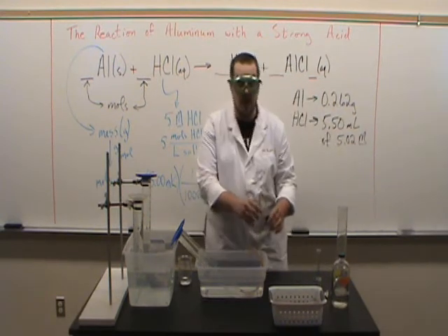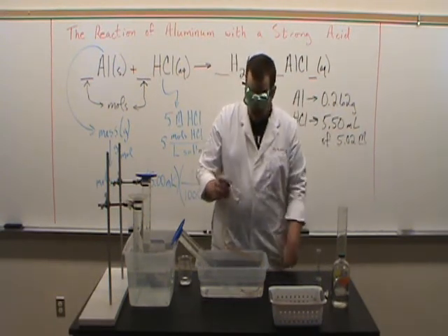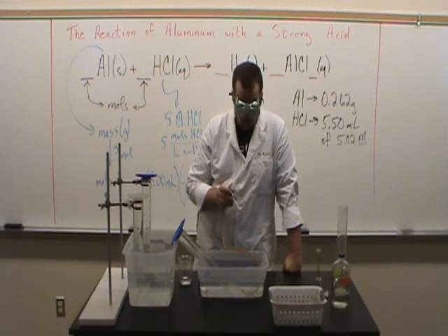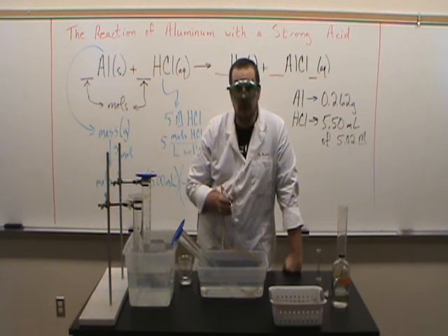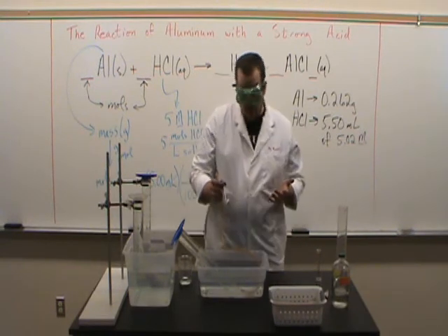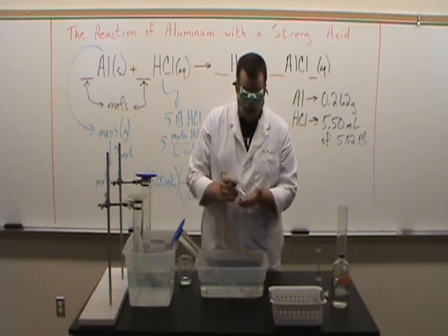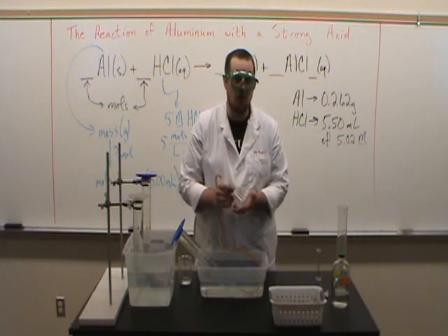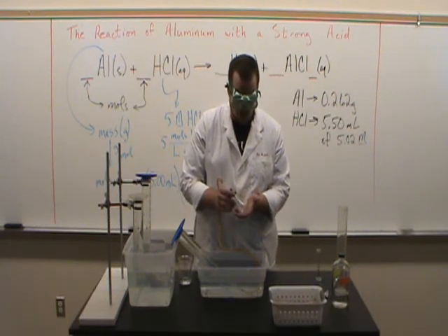And nothing's happening. Why isn't anything happening? Something should happen, shouldn't it? Well, yes it should, but patience is a pretty important thing when you're doing chemistry.